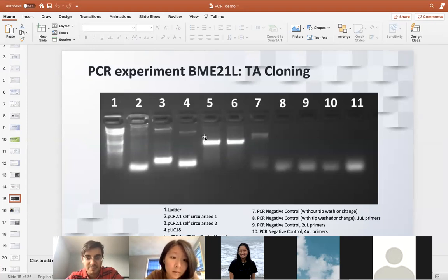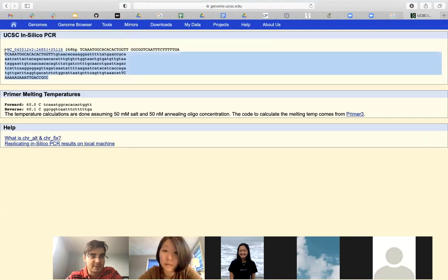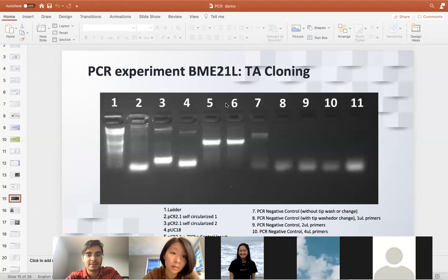If that band corresponds to this band, it must have those letters. Does it make any sense, or is it just weird?